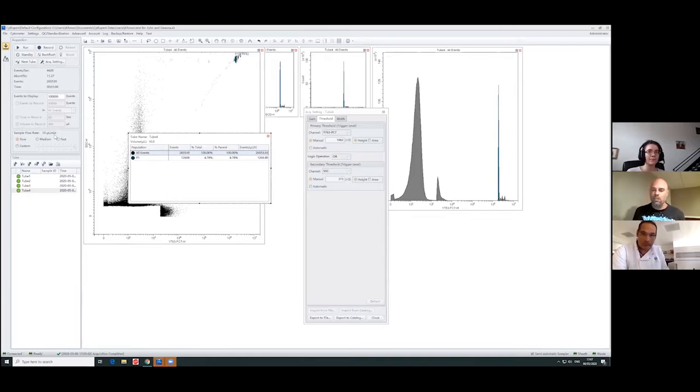Again, it's just about consistency. So if you get something, use that. A lot of them come with software packages like Rosetta. I know we work with Josh Welsh doing the NIST traceable beads and some Mie-type scattering calculations to get a quantitative curve so that you can, like I said before, change arbitrary units into something useful or understandable for people, so that you can give them a concentration, as we're doing here, a size, instead of just relative to things.